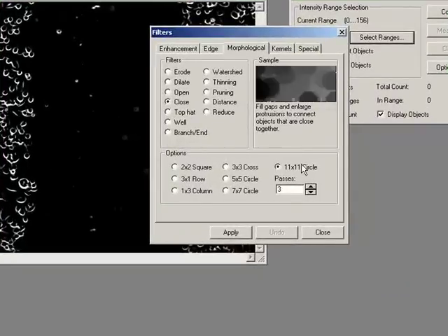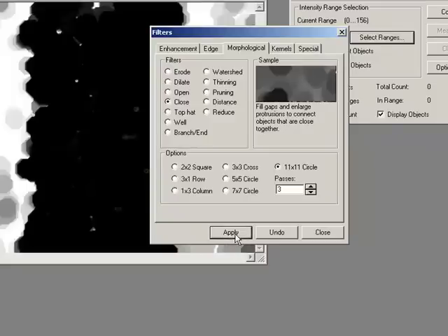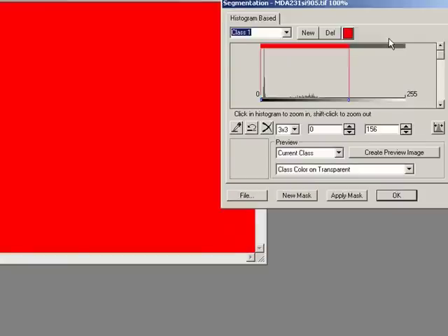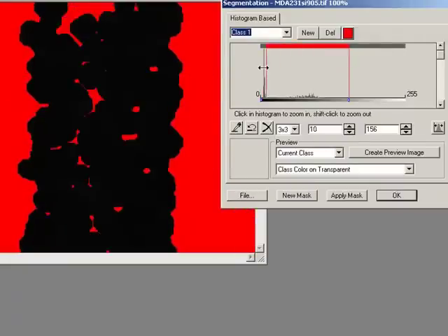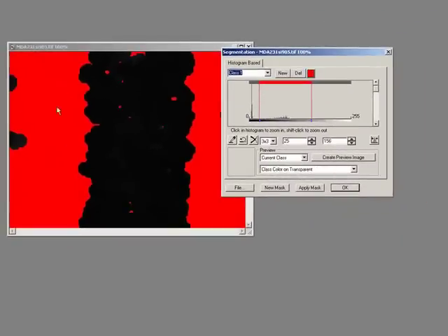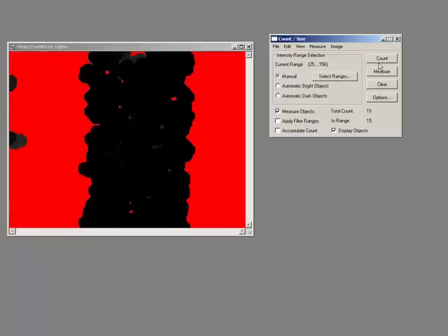A close with an 11 by 11 circle is a nice big close filter that's really going to join everything together as a solid object. Now I'm going to try and threshold. You can see here I've got my objects and I have the center, and I could try to just segment like that.